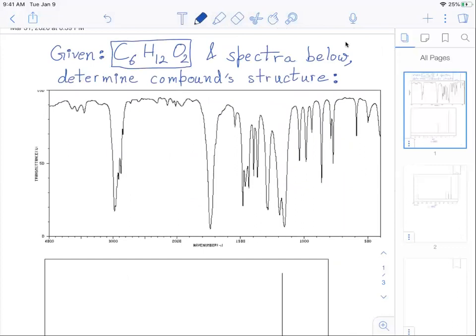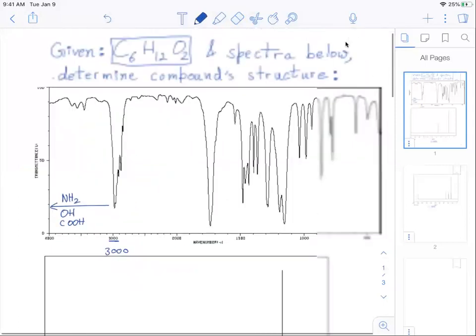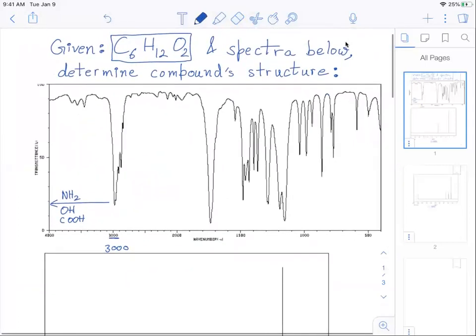In broad strokes there are very few things we have to try to figure out from an IR graph since the quality is so terrible. We usually look for a smooth curve on this side of 3000. So we look for smooth curves which can be OH, COOH. We look for twin peaks which can be NH2 related, things like that. But right now here we can tell roughly at the 3000 point. I'll zoom in so you can see that it was actually 3000 right there. So none of that is showing up and we don't have to concern ourselves with that.